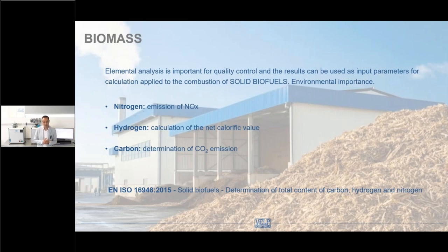A second field of application is biomass, especially when considered as biofuel to be burned in power plants to generate electricity, or for instance in cement plants. According to ISO, here you can see a very common ISO for the determination of elemental content in solid biofuels. It's important to measure hydrogen for the calculation of the net calorific value, and also nitrogen and carbon for the determination of gas emissions in the atmosphere.